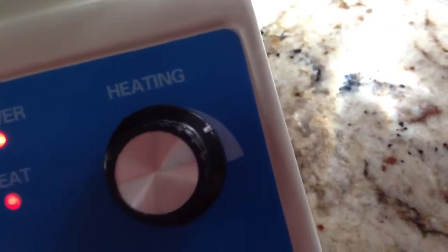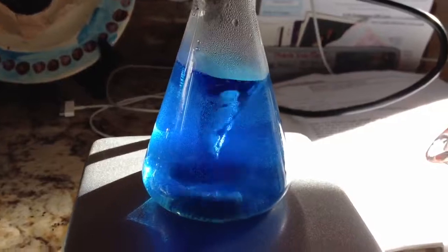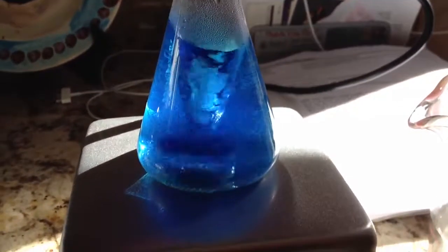The heat is pretty high, indicated by the white mark, and it's just spinning at very low speed right now. But if you turn it up, it forms a tornado inside.